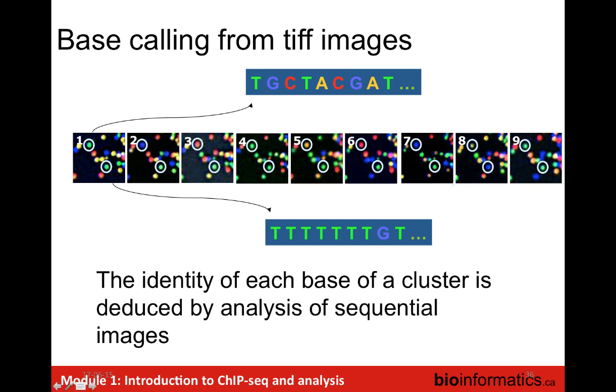In the bad old days of Solexa sequencing, we used to keep the images and actually push them off onto the server. This was back in 2008, 2009. But it was actually a graduate student who came up with a methodology for generating the sequence calls on the fly, and then we stopped storing the images. But I won't bore you with those details. But essentially, we build up the sequence that way.